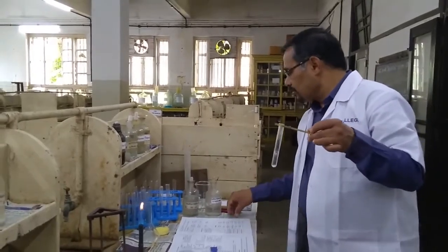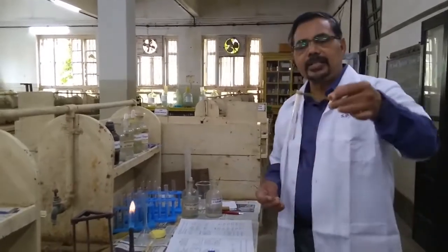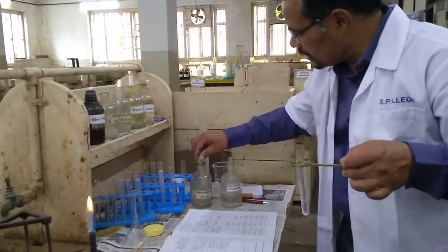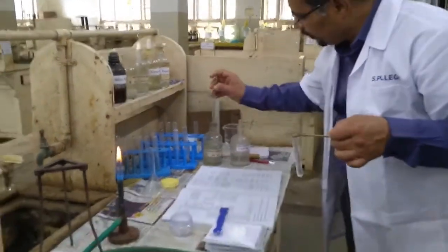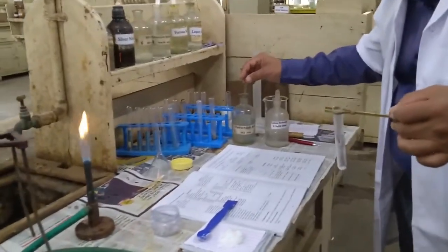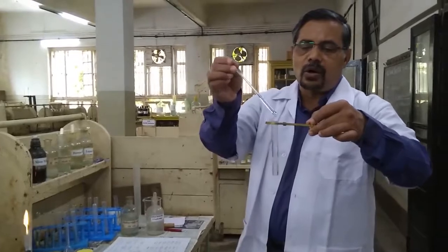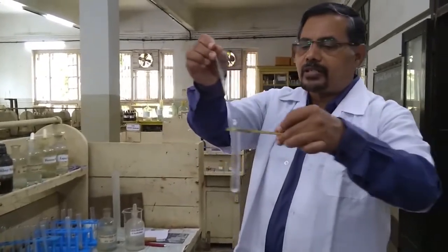One more test for testing the presence of NH3 gas is by dipping a glass rod. I will dip this glass rod in HCl solution and I will hold this glass rod on the mouth of the test tube.